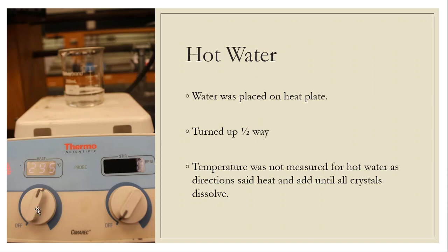I just turned it up halfway, a little more than halfway, and just let it crank up some heat and let it get warm. I didn't measure any temperature. It just says hot water, and then it said add the hot water until all the crystals get dissolved. So I'm not going to take it up to boiling, but I am going to get it to where it starts to steam and where it's going to be uncomfortable for me to hold for a long period of time.